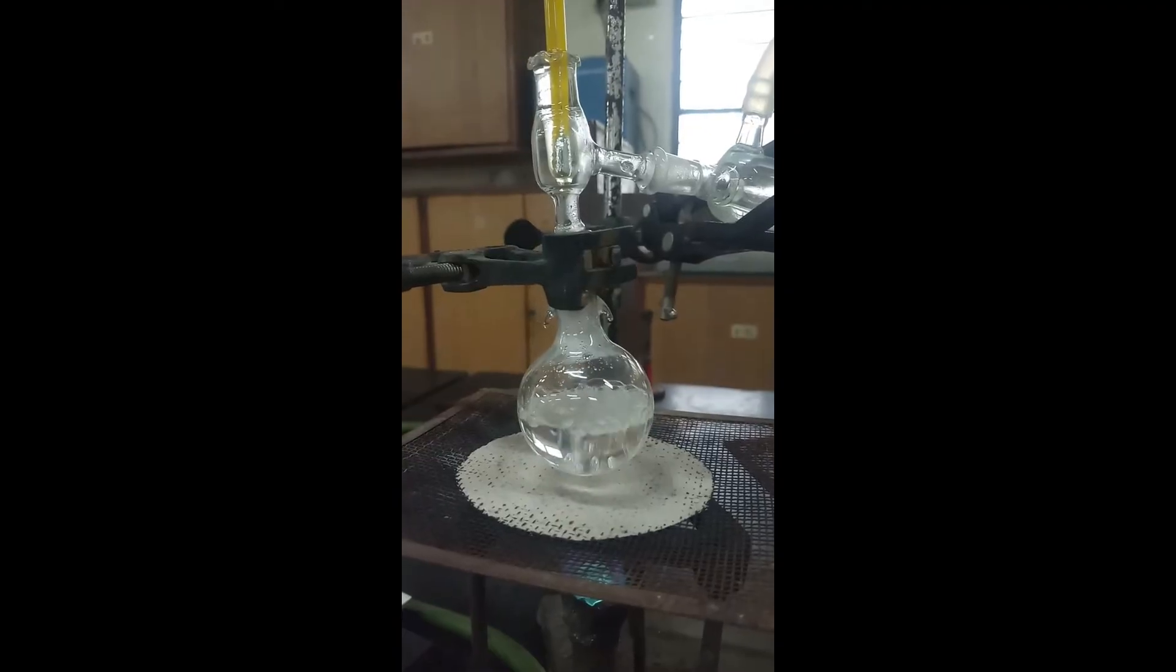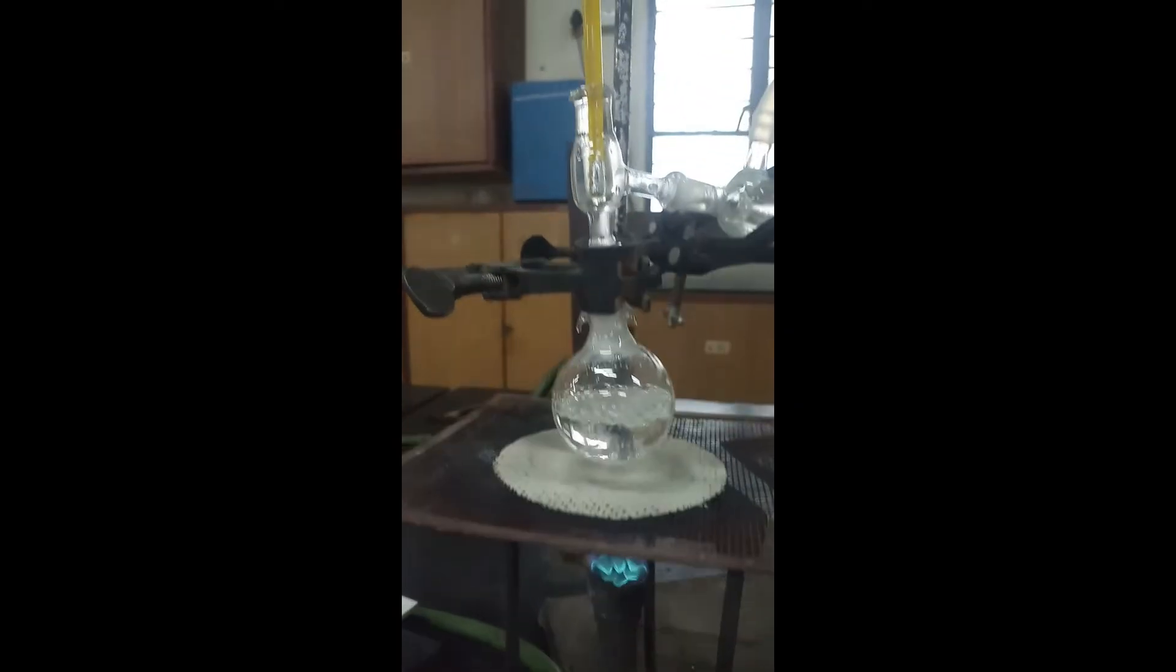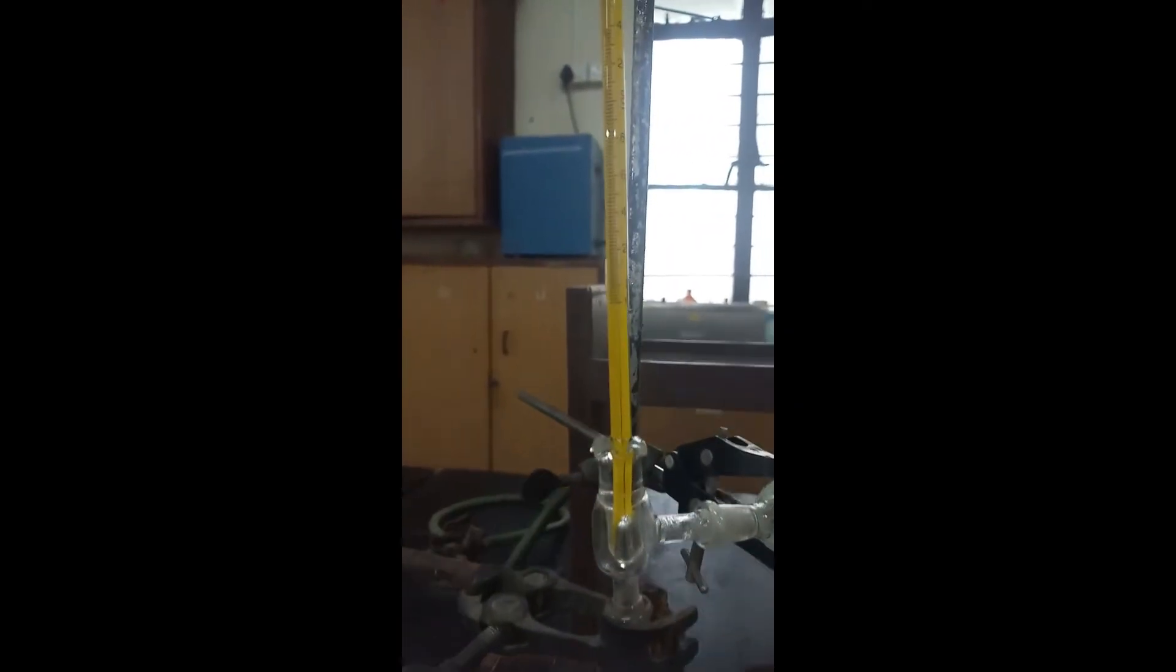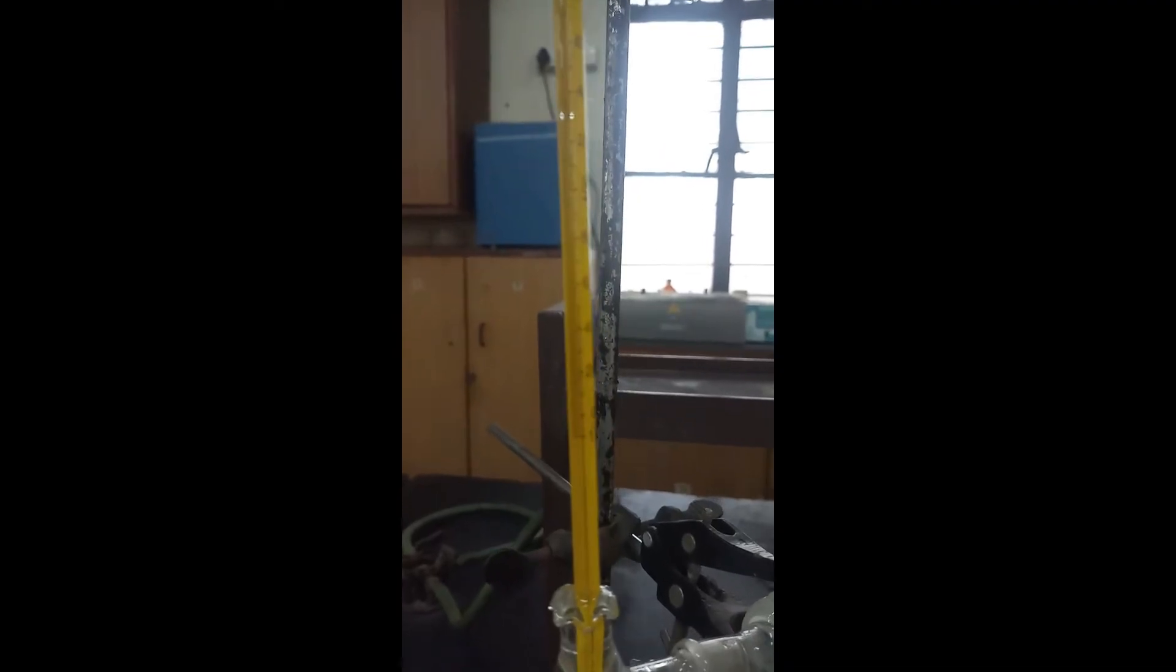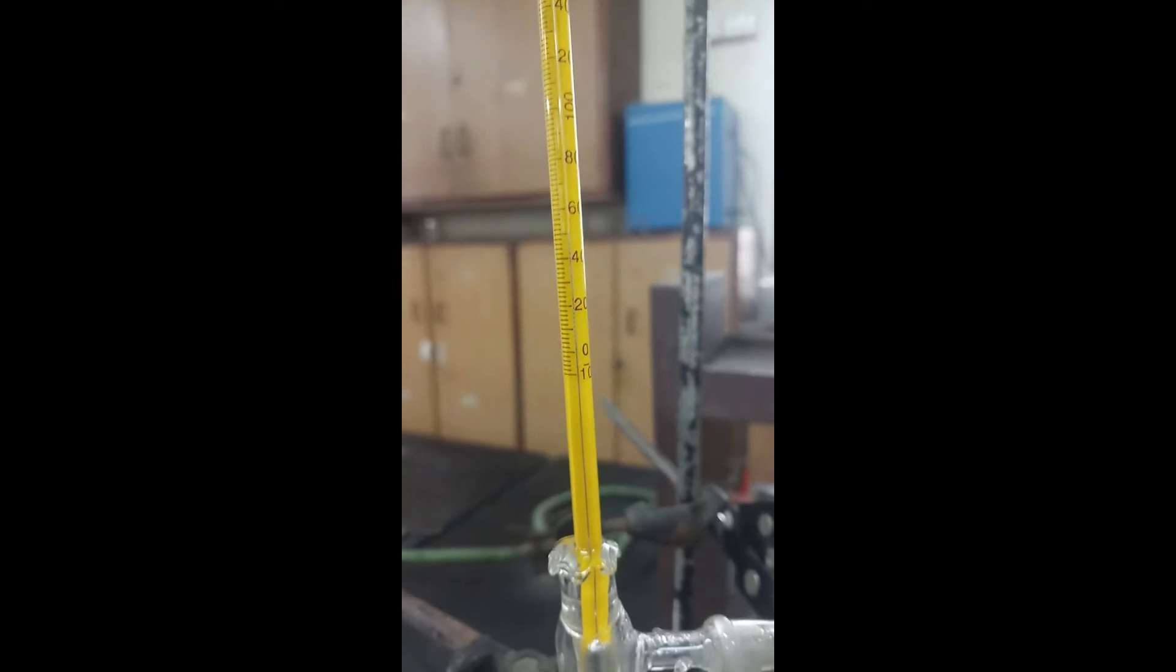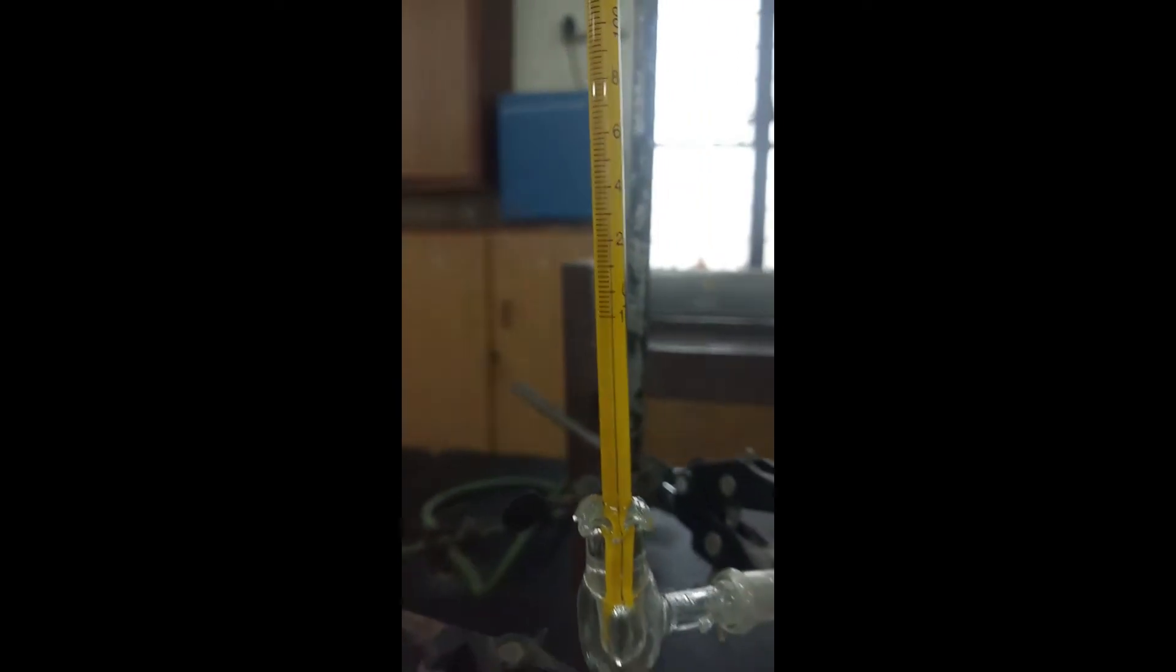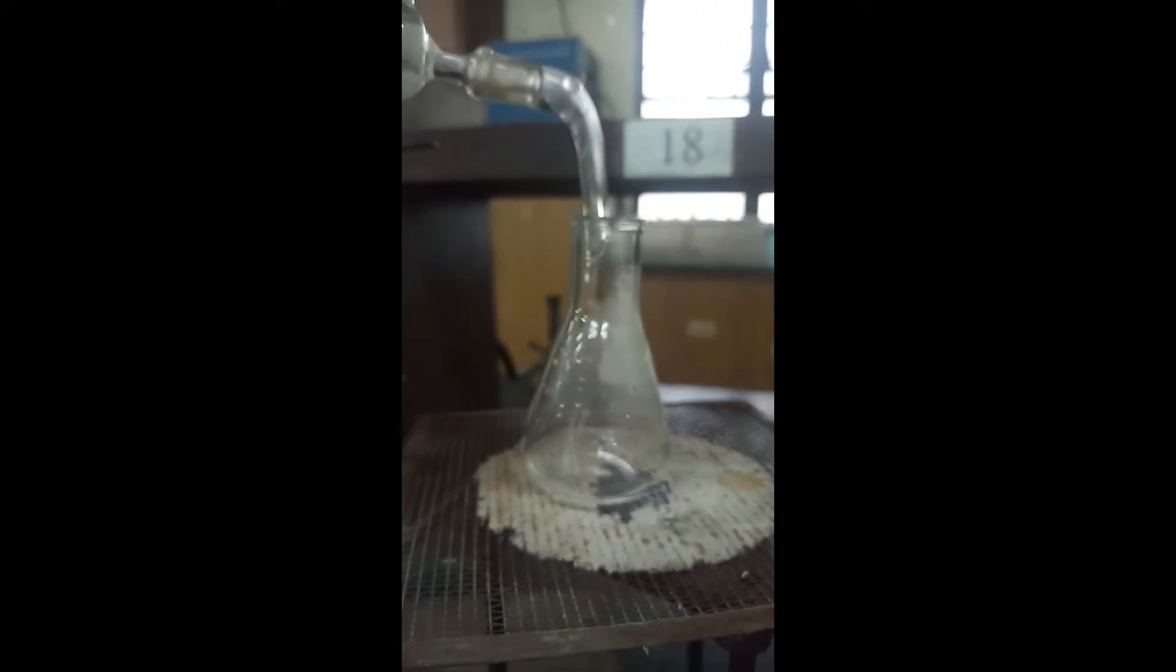Once the temperature reaches the boiling temperature of acetone, or one of the components which can be seen through this thermometer, the first component from the mixture has started boiling. That is the acetone, and it started getting collected in the receiver flask.